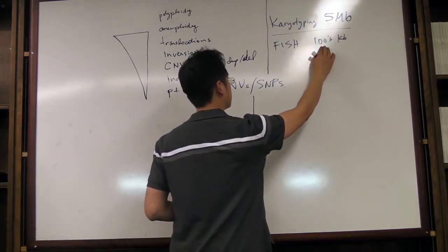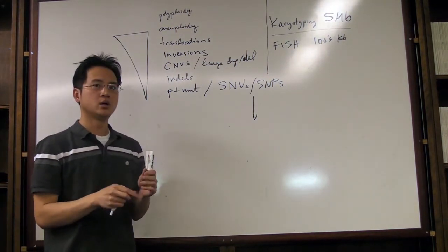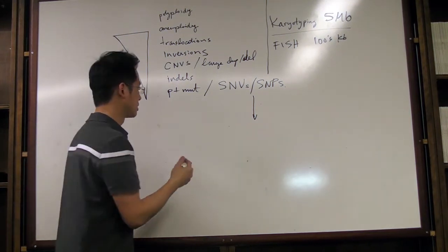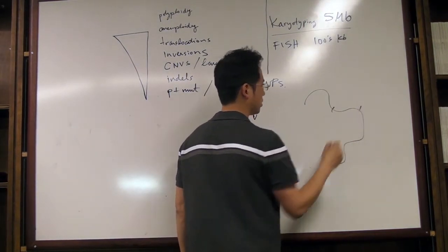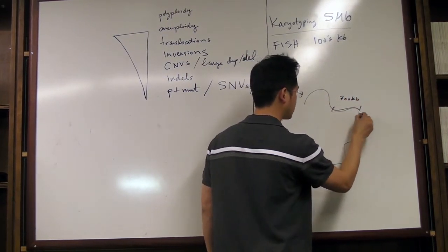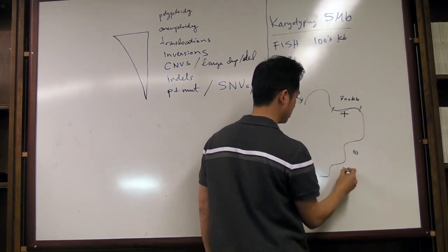To get this kind of thing, you have to be able to label a certain subsection of the genome that you're trying to look for. The probe has to be designed for a certain subsection. So let's say this is your genome, and I'm looking for just this region right here, which happens to be 300,000 bases. So you have to make a probe that's specific for this, which is on target, but not binding to the rest of the genome.